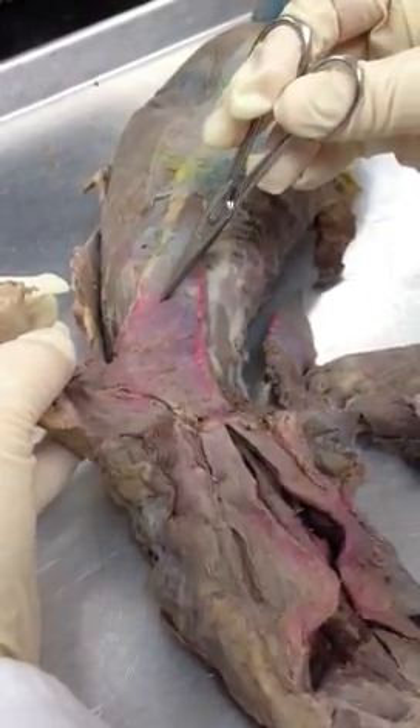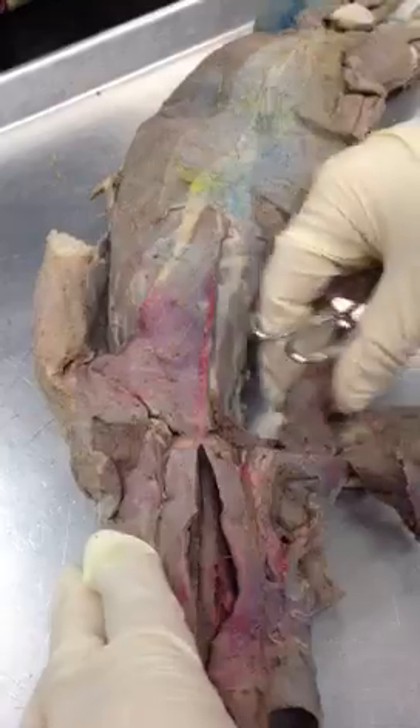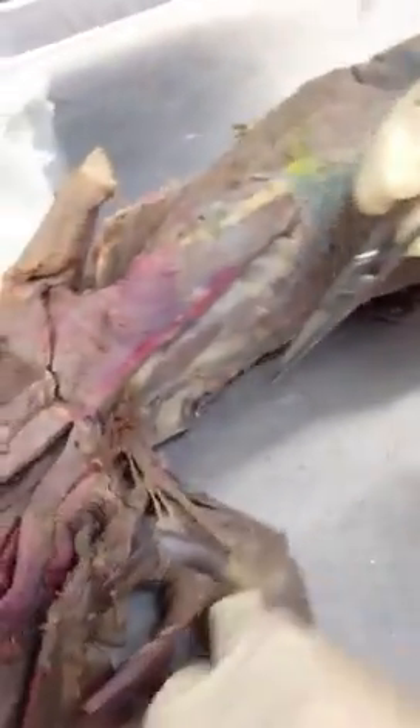Pectoralis major, pectoralis minor. On this side, they're dissected out of the way. Pull this back now — there are the arm muscles.